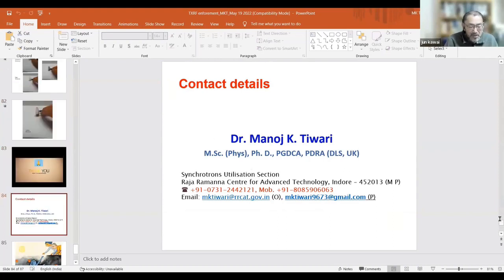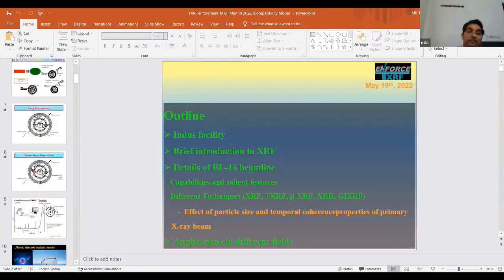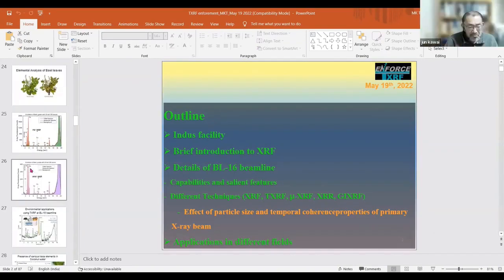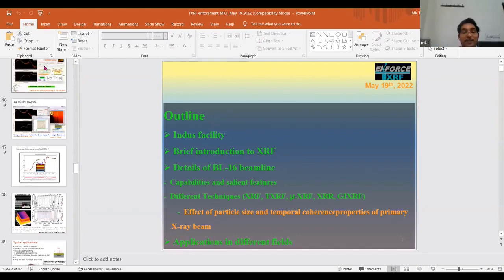You have shown us the Ayurveda medicine. So what kind of toxic elements did you find in it? Yeah, this is a very interesting question. Normally it is thought that Ayurvedic medicines use toxic elements in the system.